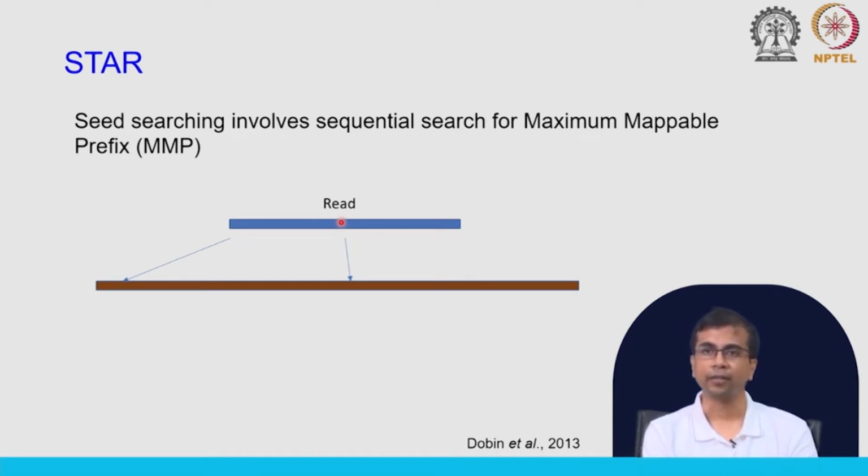Okay. So, this is expected for RNA-seq data, because we need to have this gapped alignment, and the intron regions will not be part of the read, because they are not part of the processed RNA. So, what it does is it stops the alignment, and then starts taking a seed from this region again, from here, and then again starts searching in the reference genome. Let us say it finds a match here in this part of the genome, and then it continues this process.